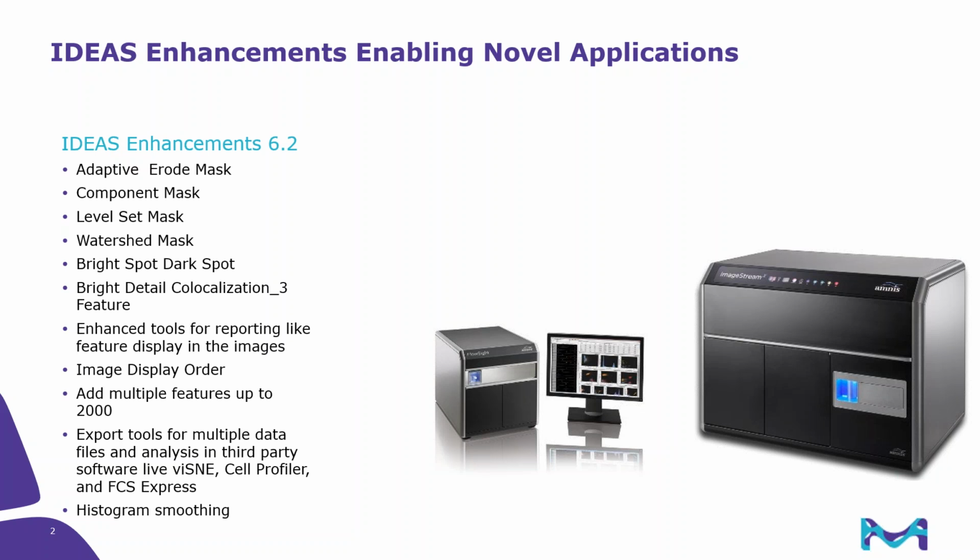Some of the core advancements that have taken place over the last year or so with IDEAS are really allowing us to look at new applications. Some of the things such as the adaptive erode mask, component masking. We have new level set masks. There's now a watershed mask in IDEAS. We have one new feature, the bright detail co-localization three-way.